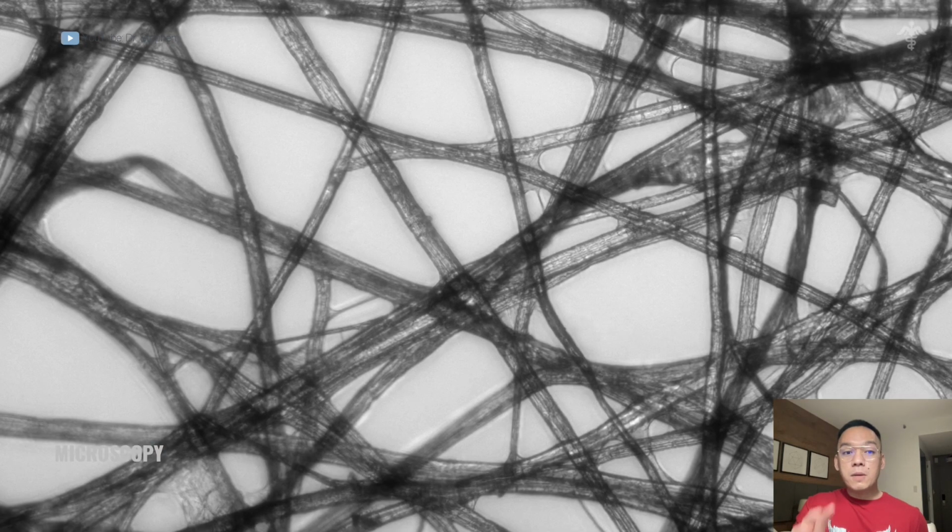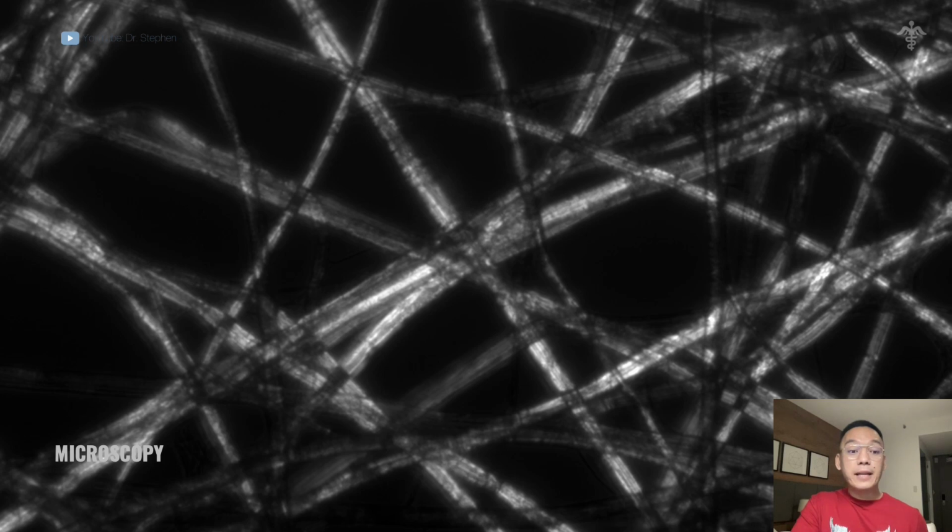I am showing you some of the illumination of your different microscopes. This photograph is coming from a bright field illumination. Sample contrast comes from the absorbance of light in the sample. The second image is another type of micrograph, called cross-polarized light illumination. The sample contrast comes from rotation of polarized light through the sample.